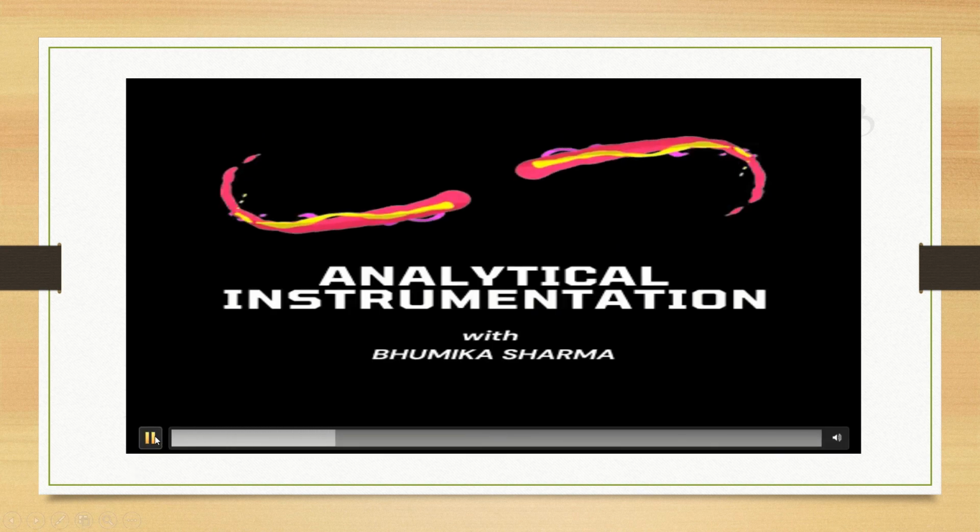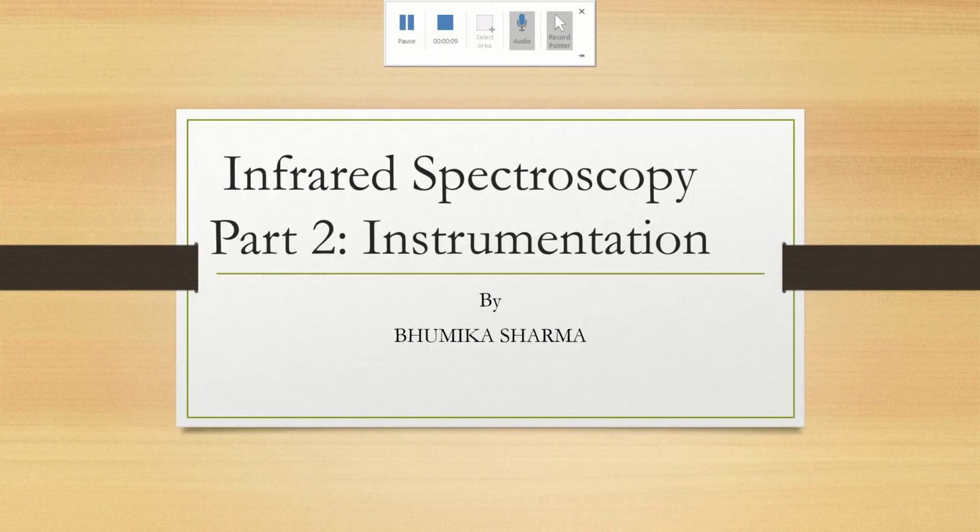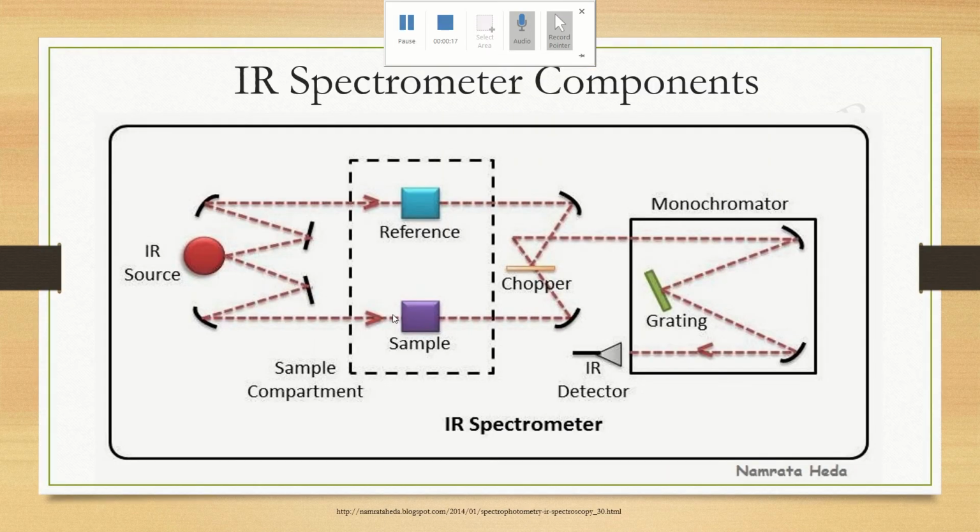Hello and welcome back to Analytical Instrumentation. Today we are going to learn about instrumentation of infrared spectroscopy. IR spectrometer is basically of two types, either dispersive or Fourier transform. So in this video we will discuss only the dispersive IR spectrometer.